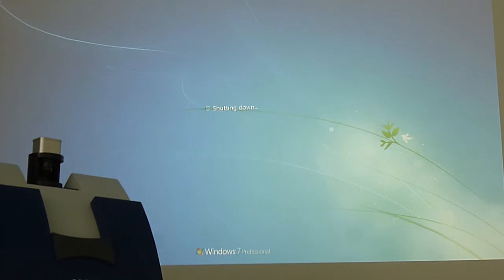So this is really one thing that I see a lot all over the world. This FireWire and Windows is really giving us a headache. Therefore we also changed.